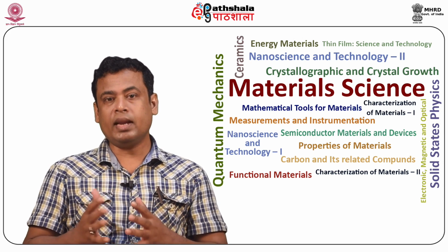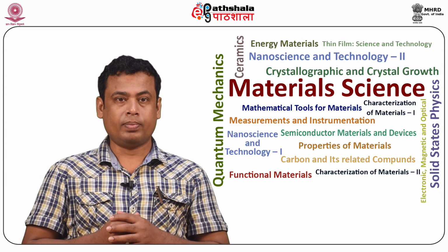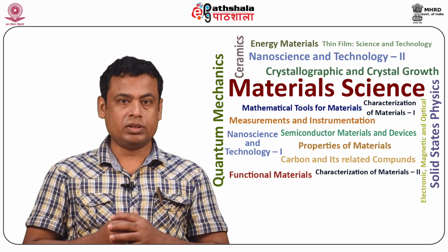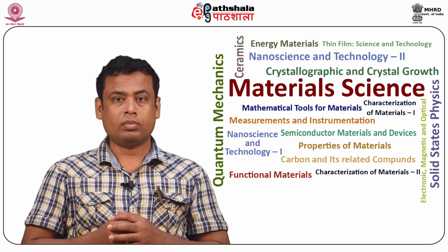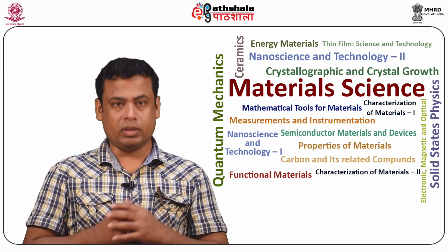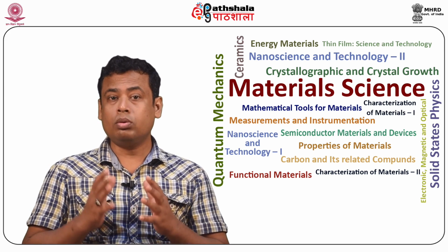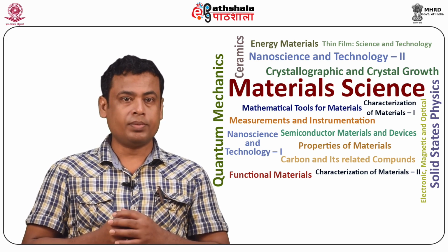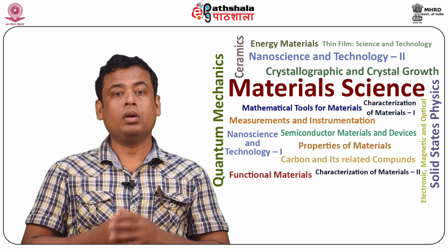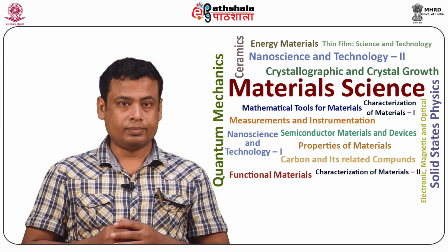The atomic interactions at different tip-sample distances are also noticed. Repulsion occurs at very small tip-sample distances of a few angstroms. A very strong repulsive force appears between the tip and sample atoms. Its origin is the exchange interaction due to overlapping of the electronic orbitals at atomic distances. When this repulsive force is predominant, the tip and sample are considered to be in contact.